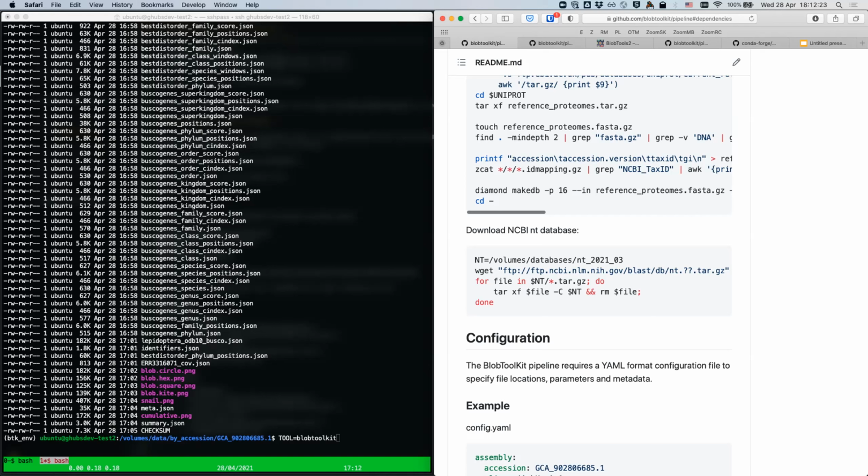You can change it to whatever you want. That's a great question. I think it's arbitrary. We pick numbers like 10 and 25 just because they look good. It's completely arbitrary. So, Lijing, that's the short answer. You can pick if you think a better value works.